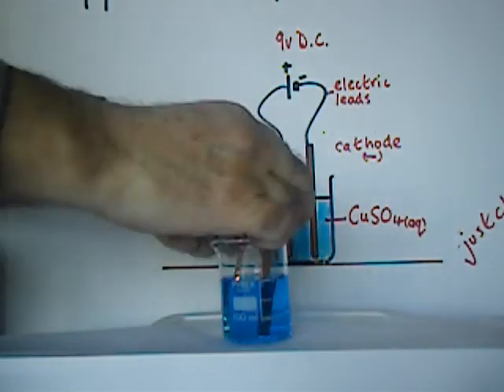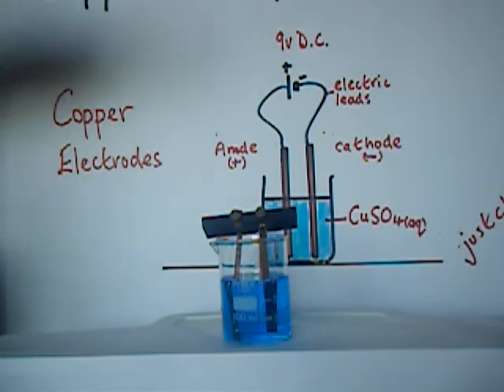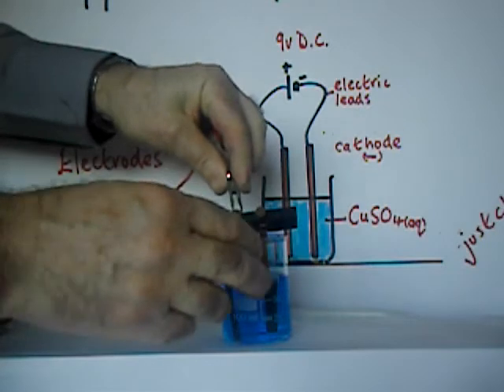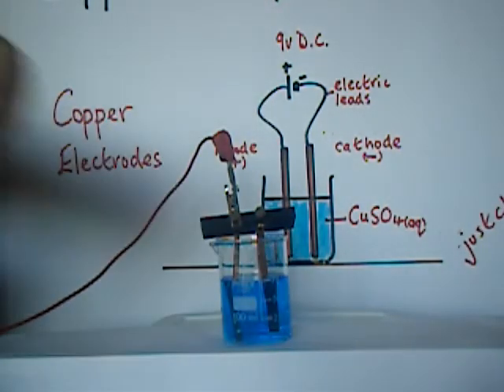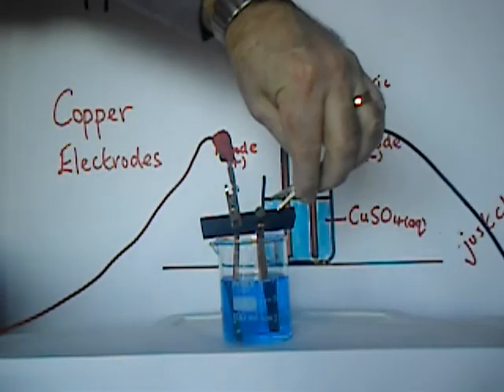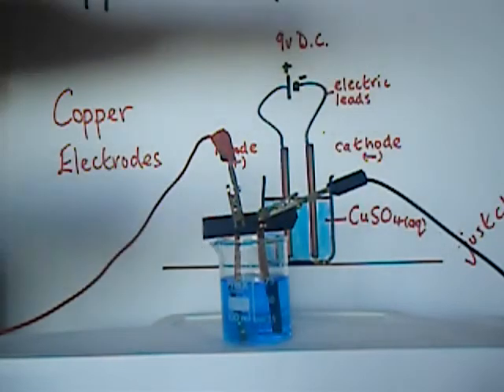These are copper electrodes. And I now have a circuit here with a power pack. And I'll connect up to be consistent. I'm going to connect the red lead, which is the positive lead, to the left-hand side. And then the black lead coming across to the other side, making sure these crocodile clips don't touch and short the circuit. And we're ready to go.